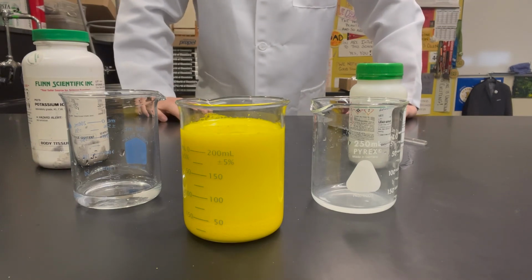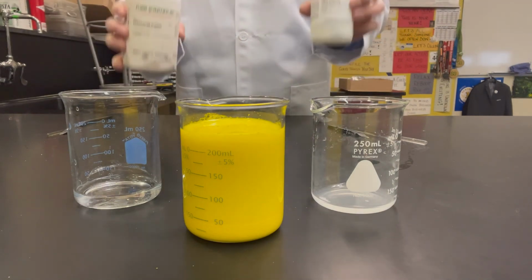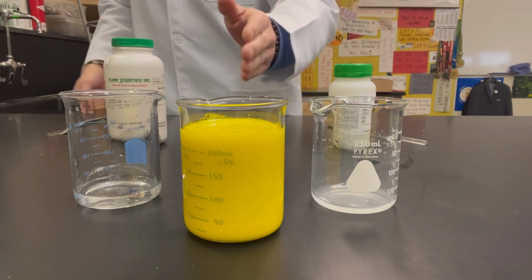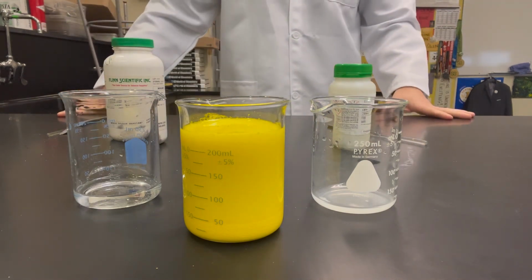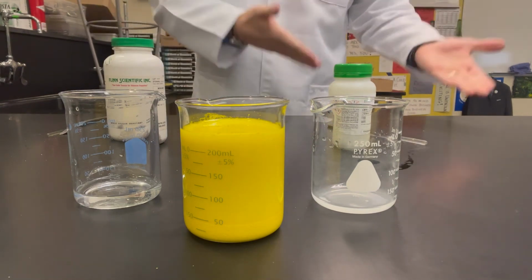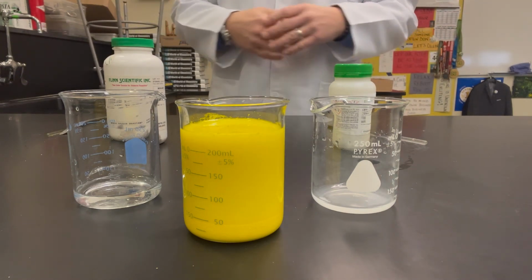All right? So once we had that double replacement reaction take place, we had, of course, our lead iodide show up as a solid, while the other compound, potassium nitrate, stayed aqueous and is just dissolved in the water. But there you have it, a double replacement reaction, live and in living color, demonstrating the difference between what aqueous is and, of course, what a newly created solid is as a product in a double replacement reaction.